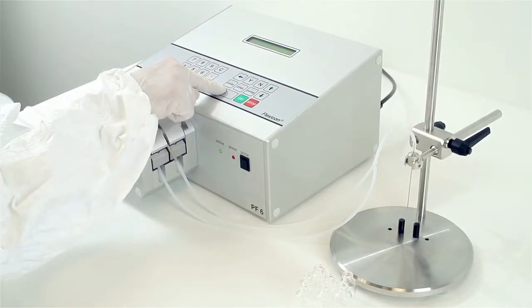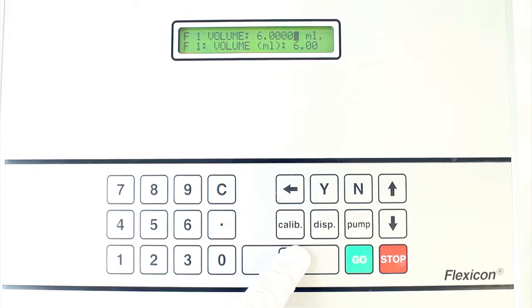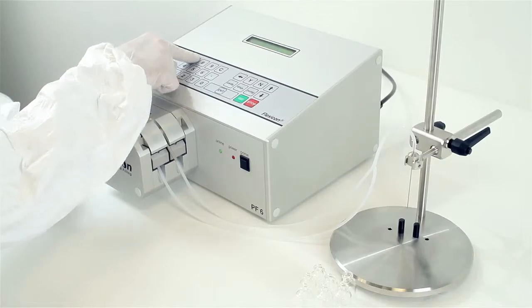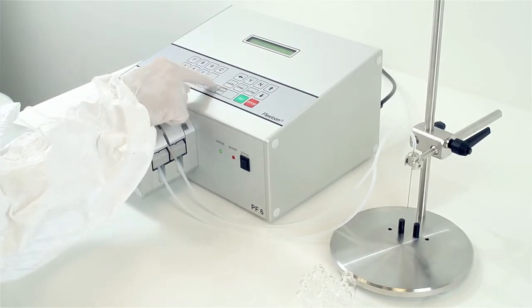Large keypad buttons and an intuitive menu system make setting or loading filling parameters a simple operation, even for operators wearing gloves or if the unit is behind a glass panel.